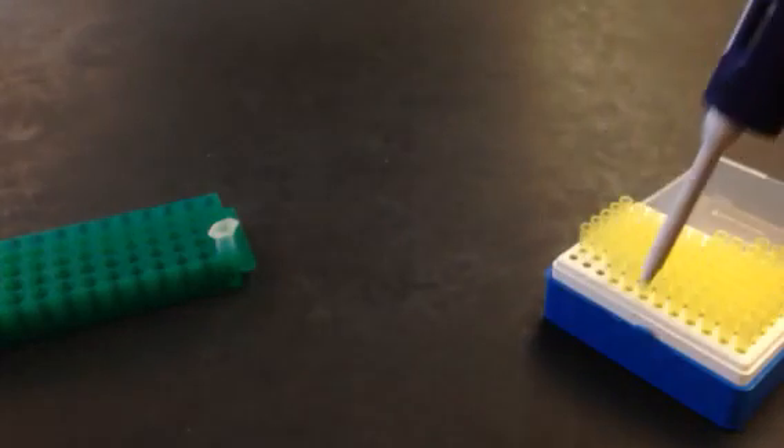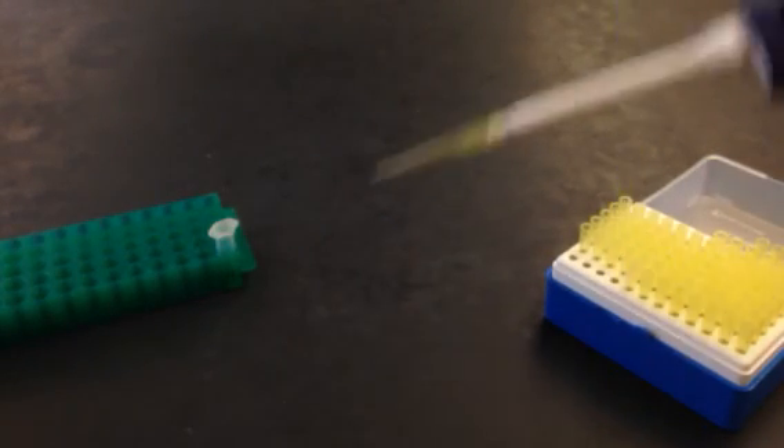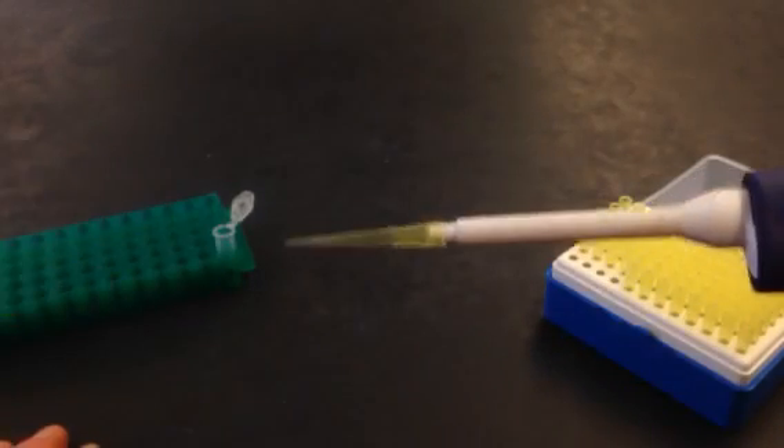The next thing I need to do is get a tip on it. You don't have to push really hard — just tap a little bit and you'll get the tip on there. Now the next thing to do is to get ready to pipette the liquid.